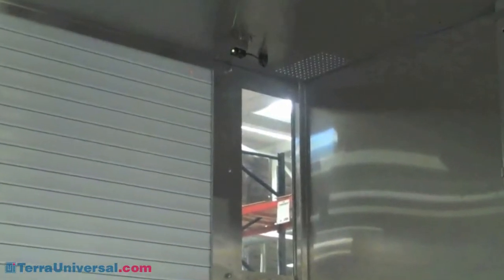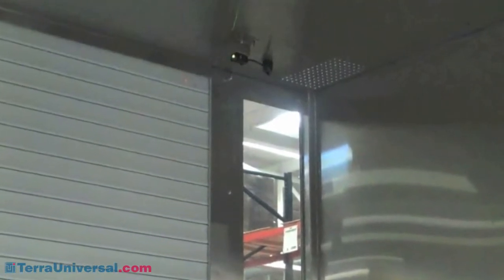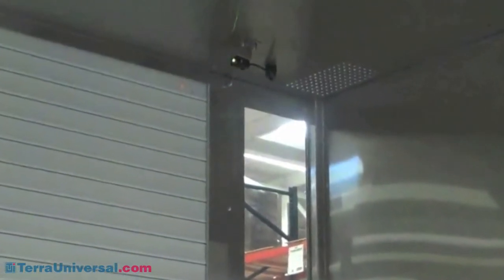The infra-red sensors also activate the interlock. As long as one door is open, the opposing door remains closed. This feature eliminates cross-contamination of the clean room.